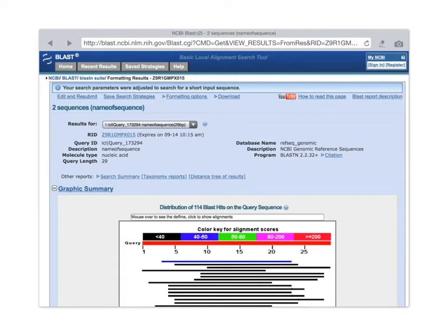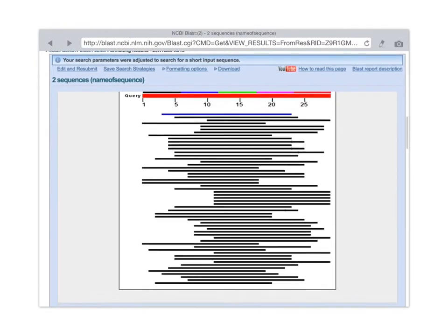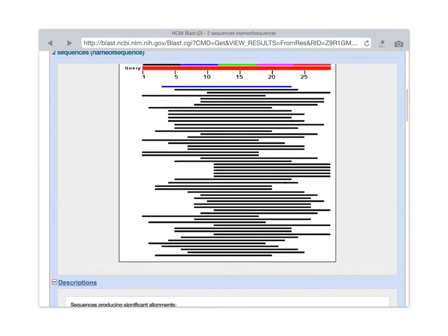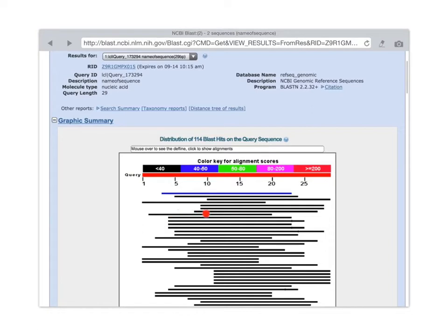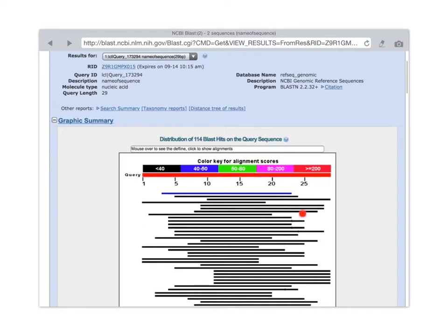And these colored lines down here represent a graphical representation of, for these 29 nucleotides that make up our query sequence, which part of those 29 nucleotides, with the key shown here, which part of those 29 nucleotides matched. Each one of these horizontal lines represents a sequence that's in the database that matches.